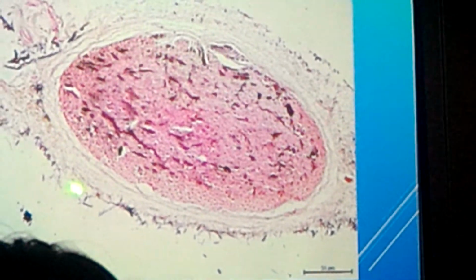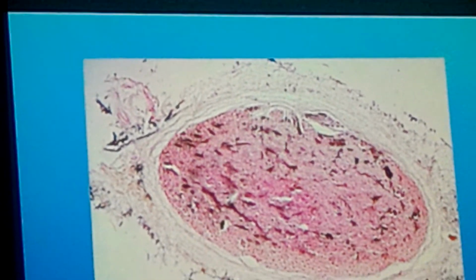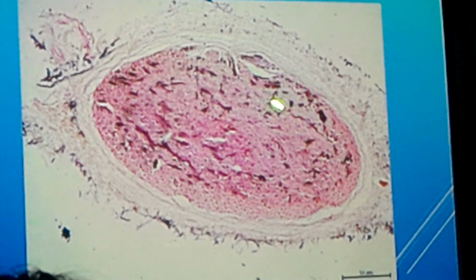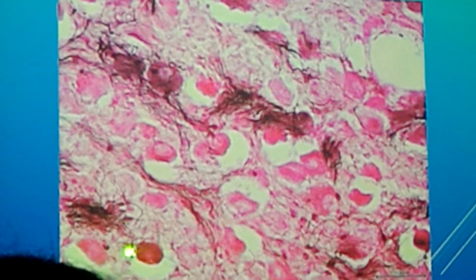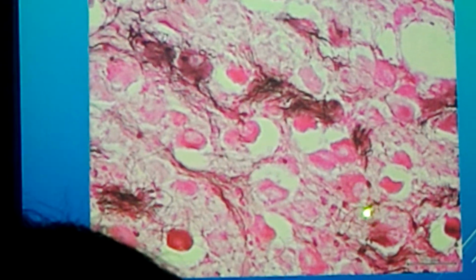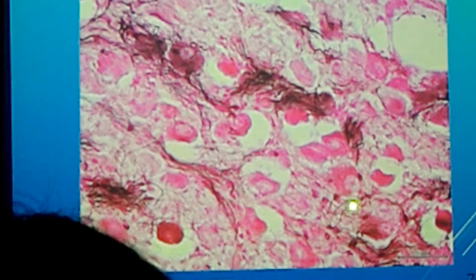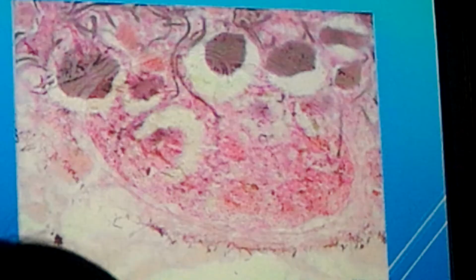So again, if asked to classify, it's the same, it's nervous tissue. But if you're asked to classify according to function, the dorsal is sensory, right? And the sympathetic is motor. You won't see it but it's multipolar. So these are the cell bodies, the nucleus is located at the periphery, and there are no satellite cells. So it is motor. Most likely they will show you these.